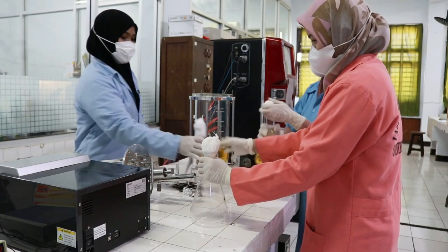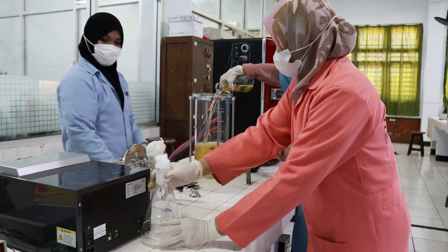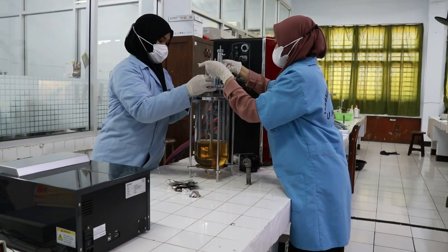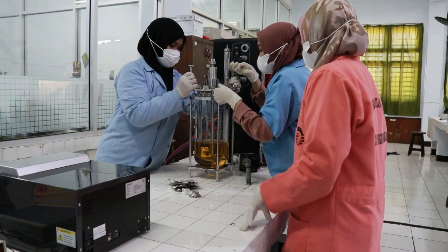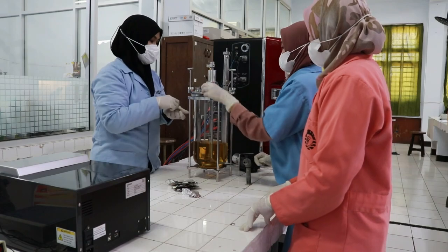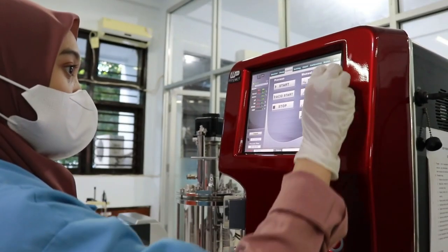The fermenters are outfitted with mechanical and electrical equipment, and some even have a control system for controlling the factors or variables that affect the ultimate goal of fermentation in terms of microbial growth. Potential of hydrogen, temperature, dissolved oxygen, media turbidity, foam formation, and so on are the variables in question.